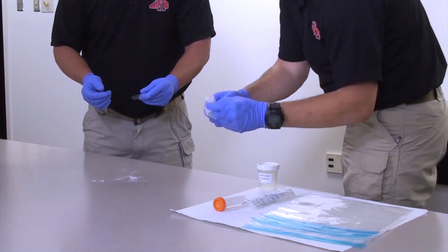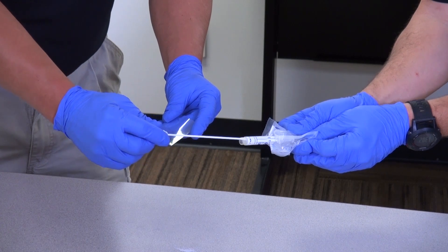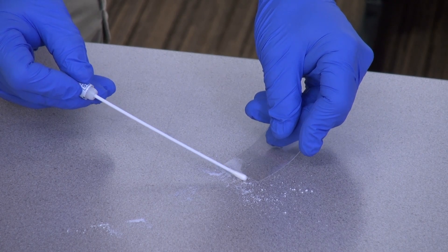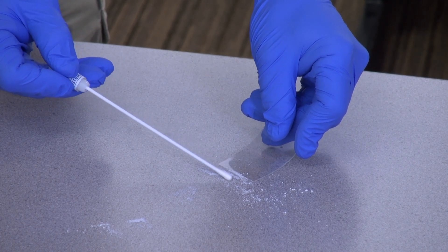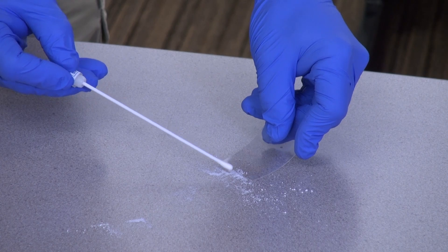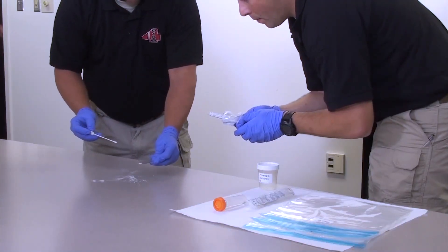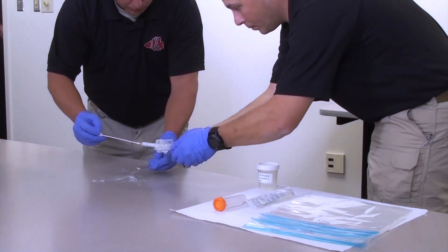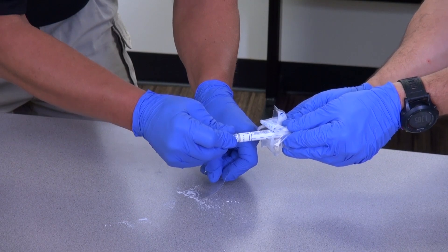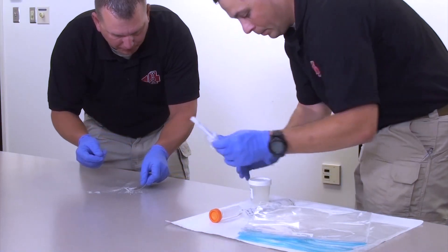The facilitator then loosens the cap of the tube containing the swab. The sampler removes the swab from the tube. The sampler holds the laminated card at an angle on the surface next to the powder. The swab should be used to gently move the powder onto the card with short pushing motions, rolling the swab over the edge of the card to avoid popping the swab and causing an aerosol hazard. The facilitator moves the tube container to the sampler. The sampler then places the swab back into the tube, taking care not to touch the outside of the tube.